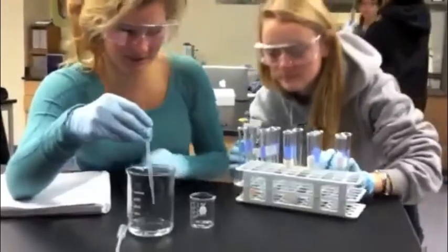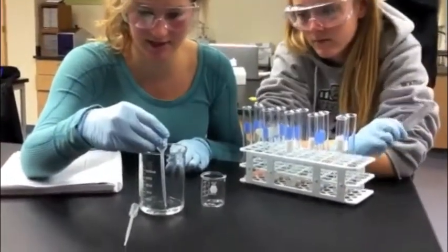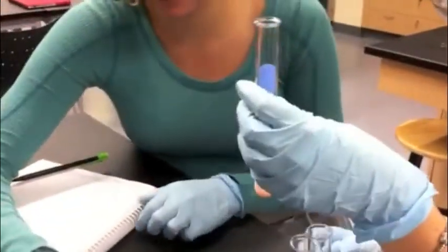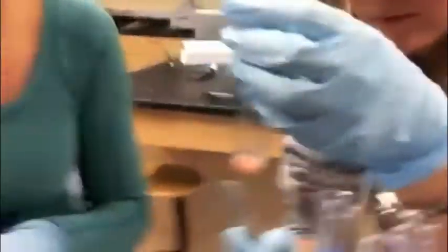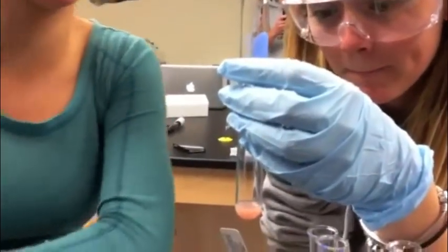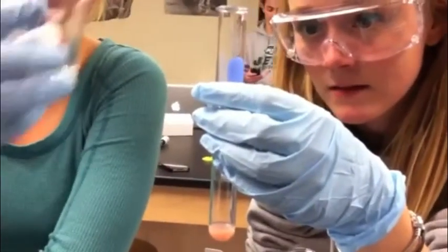In each of these little beakers, we're measuring out 2 milliliters of hydrogen peroxide, and we're going to pour this beaker into one of these, which have varying amounts of silver nitrate in them. Then we're going to measure how high the bubbles go up to record the reaction.